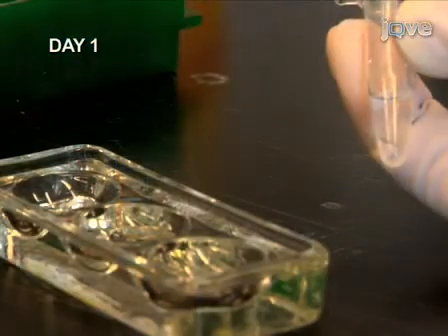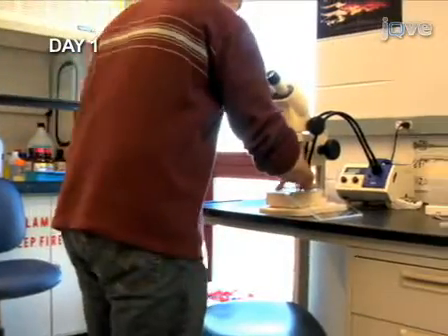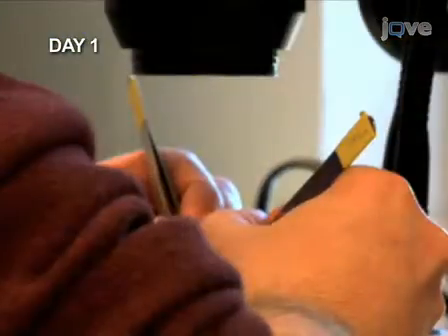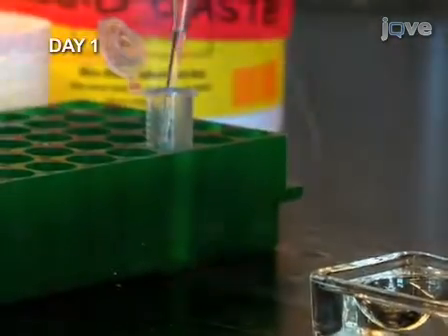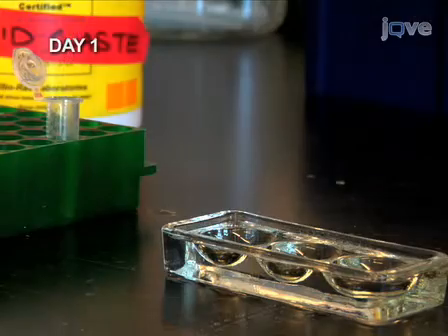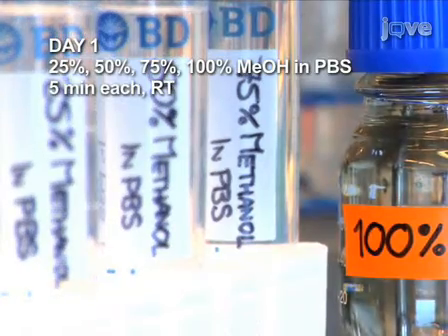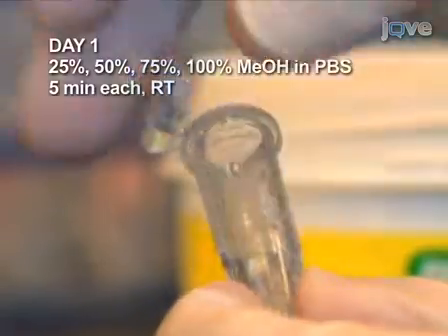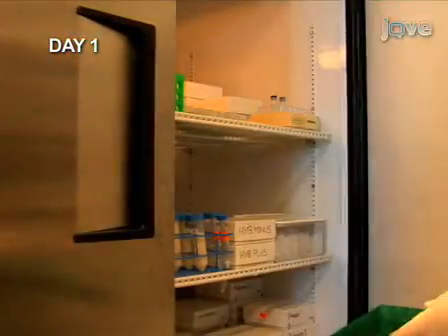Next, remove the chorions of the embryos. Place the embryos in glass depression plates and use watchmaker forceps to pull off the chorions. From now on, use a fire-polished glass Pasteur pipette to transfer the embryos; otherwise the embryos will stick to regular polypropylene tips. The dechorionated embryos are transferred through a series of washes of increasing methanol concentration, with the last wash in 100% methanol. Finally, place the embryos in fresh methanol and store at minus 20 degrees overnight.